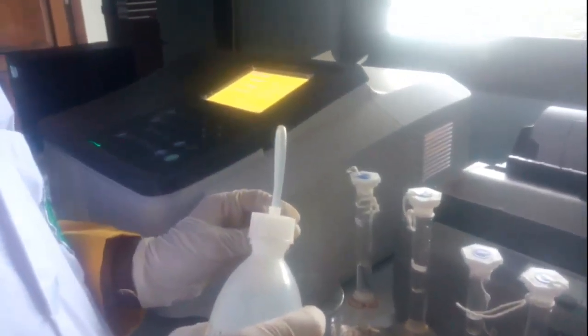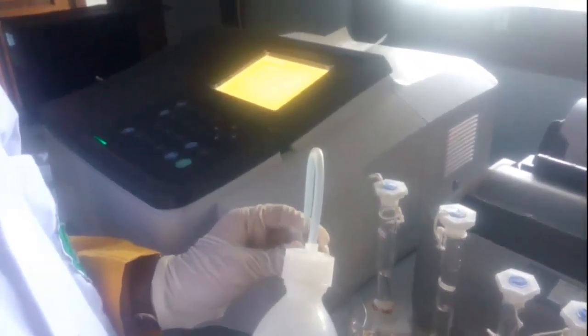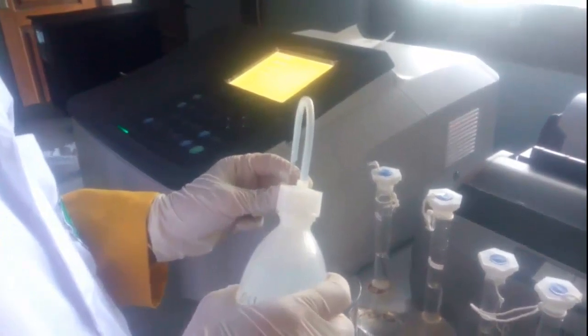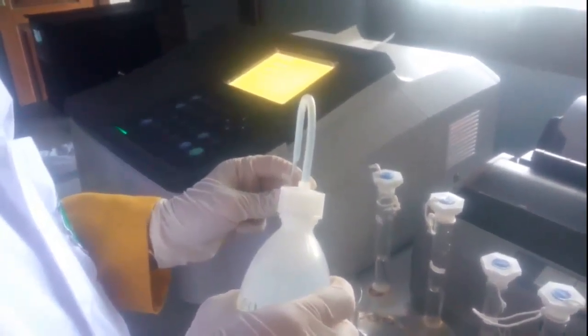Wash off the cuvette with aquadest. Then pour the blank into the cuvette. The blank is also aquadest.